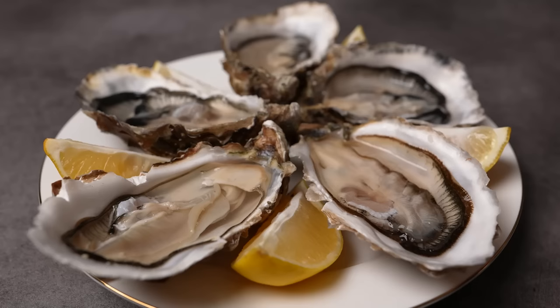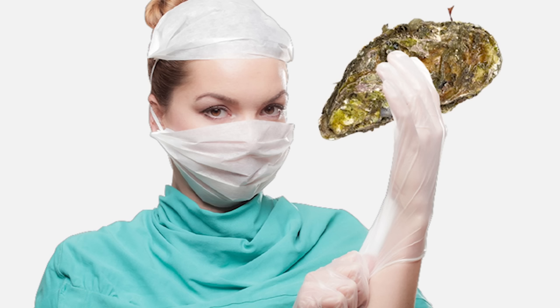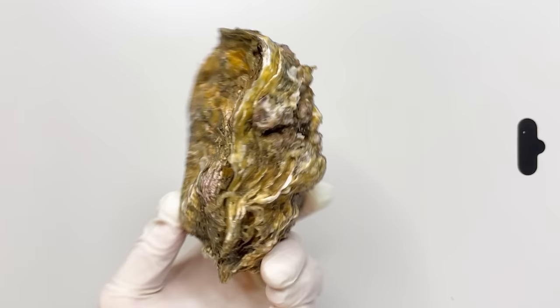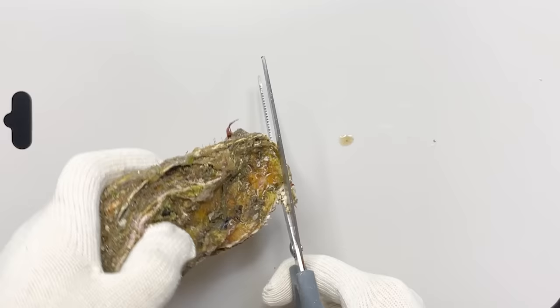So, it's fun to observe it carefully when you eat oysters. There are many strange things inside the oyster. So let's start the oyster anatomy right away. First, open the hard shell. Because the shell is sharp, don't forget to wear gloves. And hold the rounded part downward. And cut the shell with scissors.